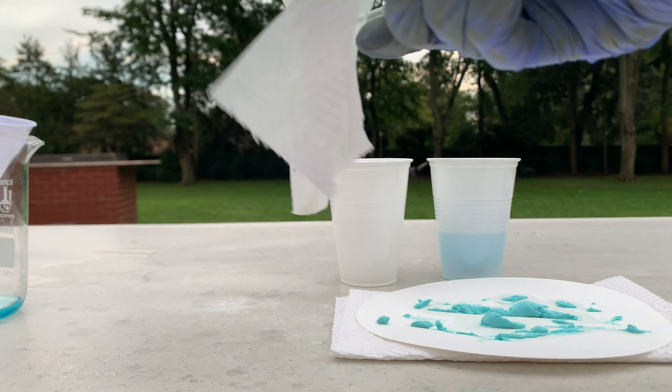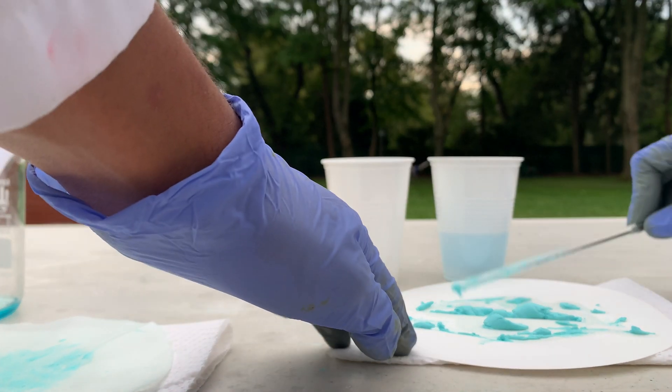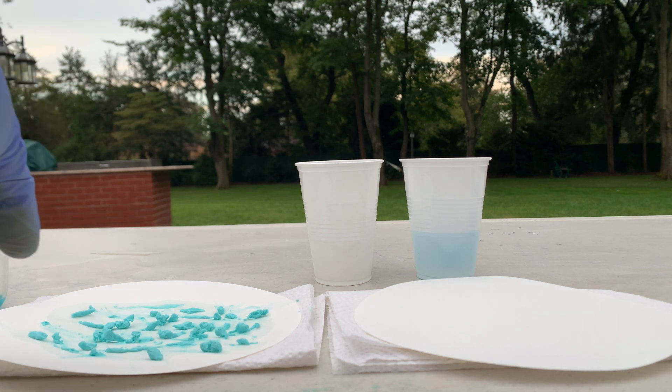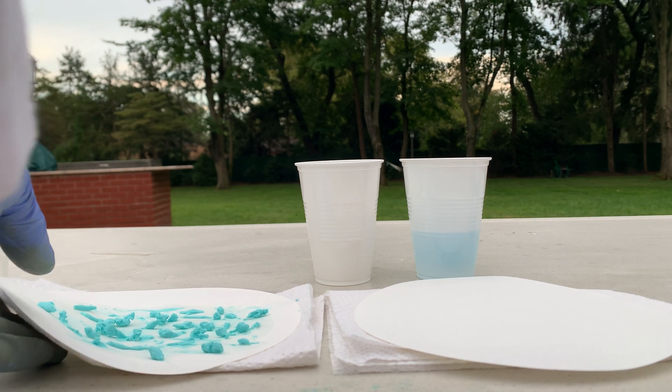It seems like I got most of the copper carbonate off of the filter paper and I'm going to let it dry on this filter paper now. It's pretty much dry so I'm going to transfer it to one more filter paper to completely dry and then I'll finally put it into my container for storage.